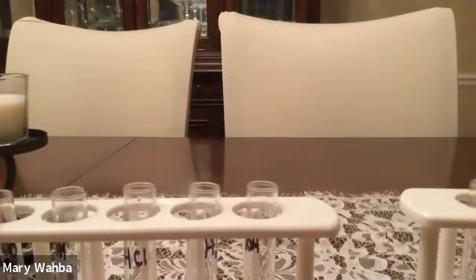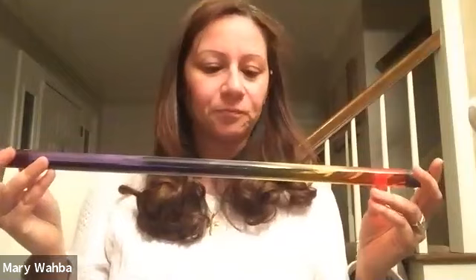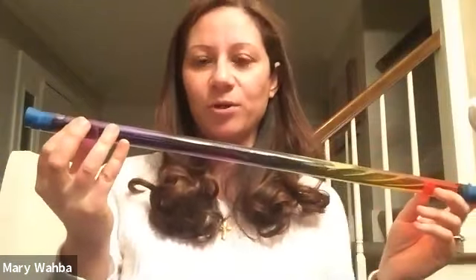So I want to show you another demo of universal. I got this tube and I filled it with water and universal indicator. Remember, it is green when it's neutral, so it's green. And then to this side, I opened it and added a couple of drops of acid. And on this side, I opened it and added a couple of drops of base.